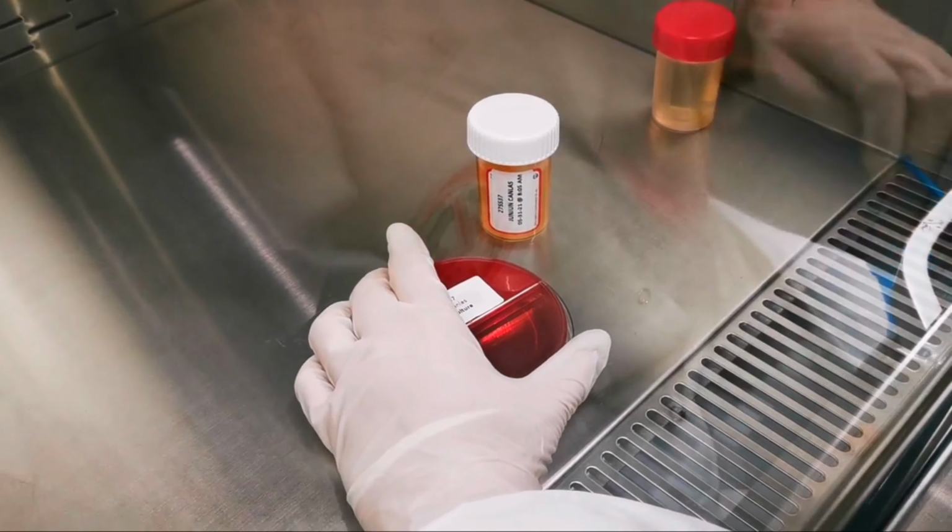Then put it in the incubator to allow bacterial growth. We will check it on my next duty, tomorrow afternoon.